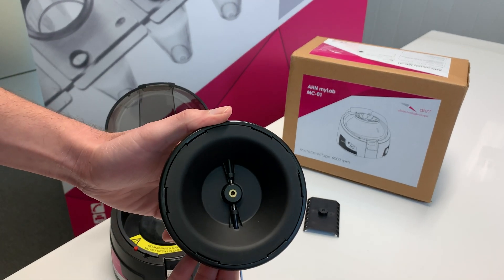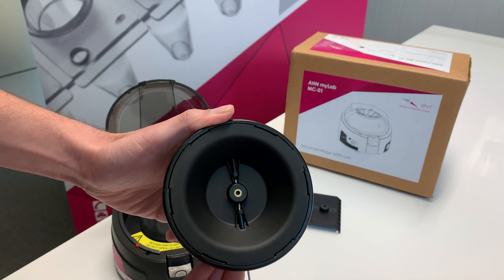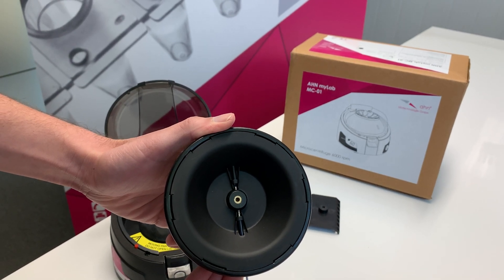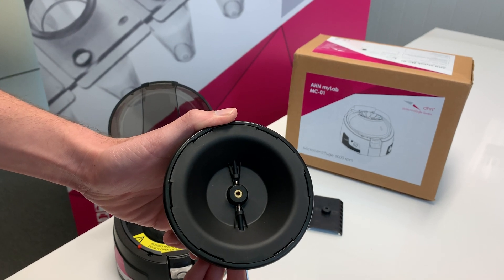What actually happens here is that the key is making contact with the screw. Maybe the first time the key is unable to make appropriate contact, but only a fine adjustment will make it go through.